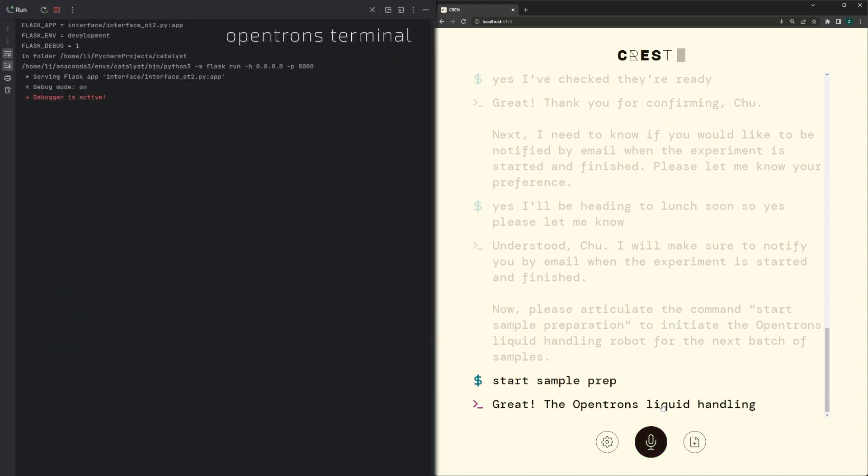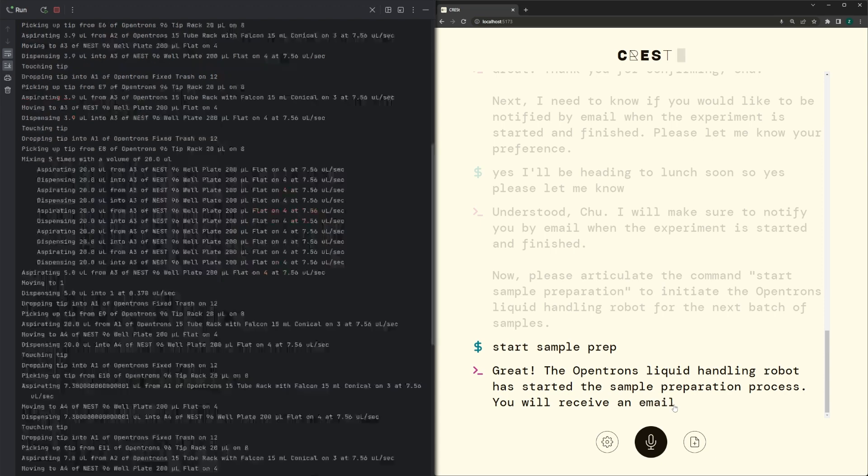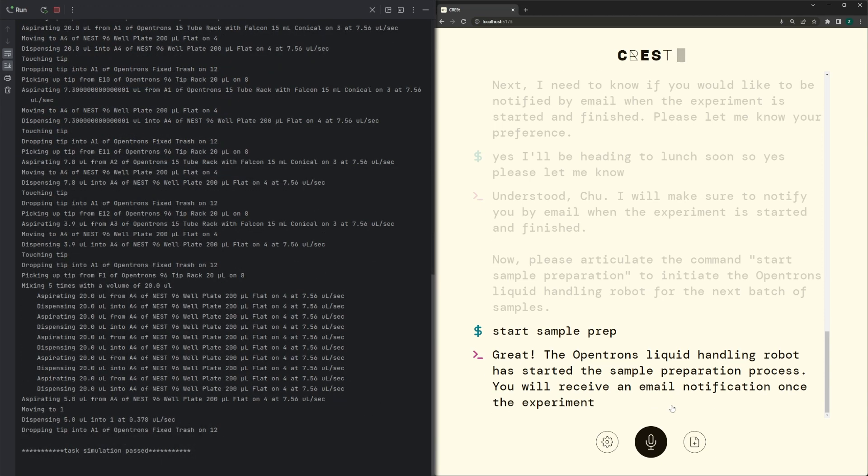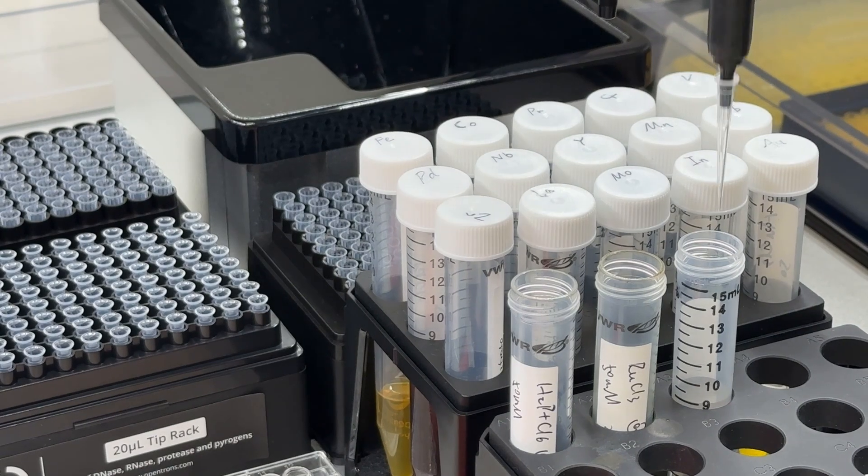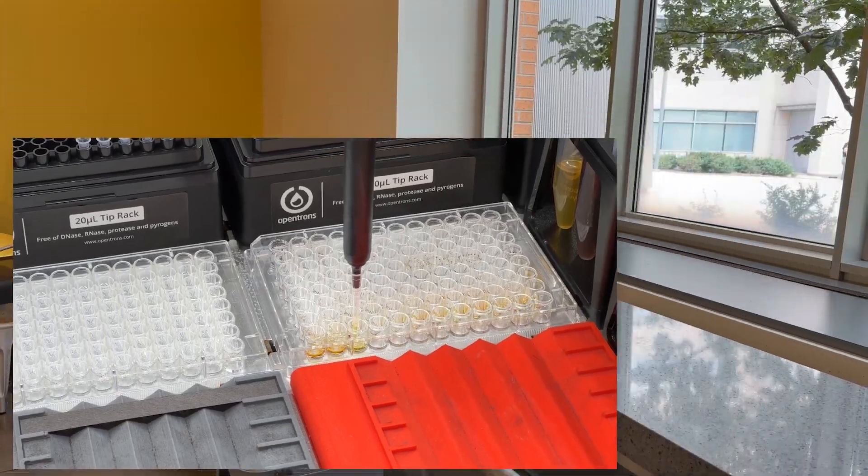Great! The Opentron's liquid handling robot has started the sample preparation process. You will receive an email notification once the experiment is finished.